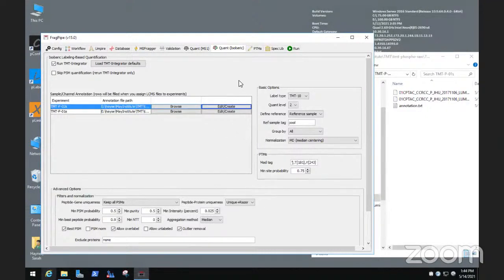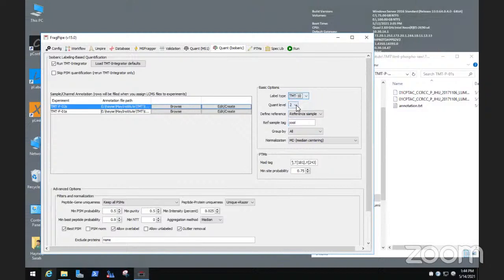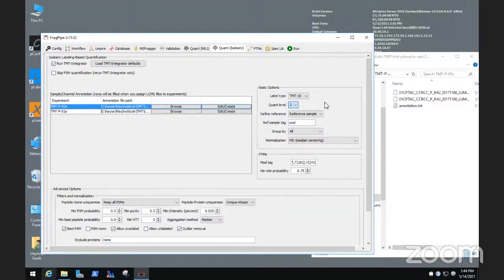Again, make sure you know your data, whether it's TMT 10 or 11, or if you're quantifying from MS2 level, MS3 level. We are creating more workflows, for example, a real-time MS3 workflow that you can do on Eclipse. We probably will provide a separate, slightly customized workflow for that. So overall, it's pretty straightforward to use if you stick to the basic stuff, but it's easy to customize as well.